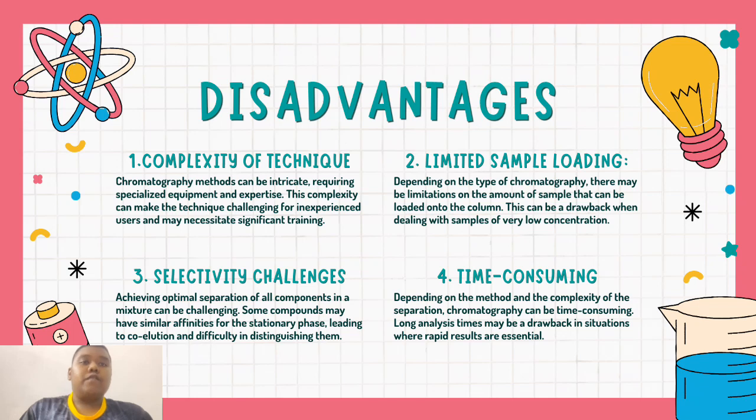So, now let's move to the disadvantages of basic chromatography. The first one is complexity of technique. Chromatography methods can be intricate, requiring specialized equipment and expertise. This complexity can make the technique challenging for inexperienced users and may necessitate significant training.